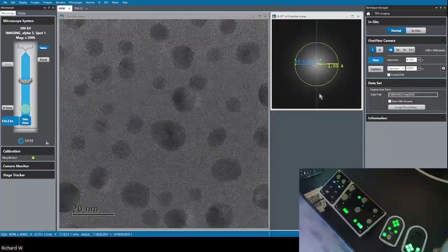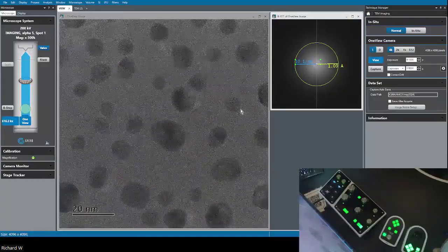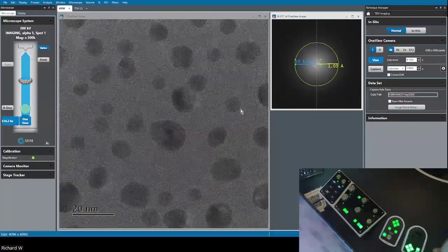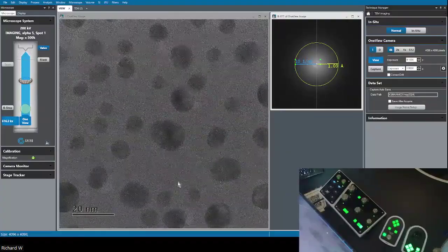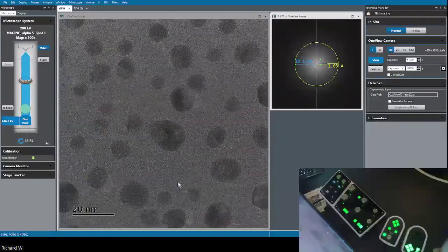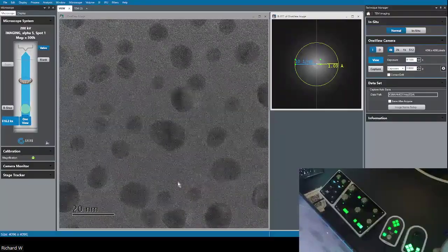Going beyond 500,000 times, we are then oversampling, which means we'll be reducing the field of view. We'll just be magnifying a smaller region, but we won't be increasing the resolution of our images, because the resolution is limited by the microscope rather than the camera.